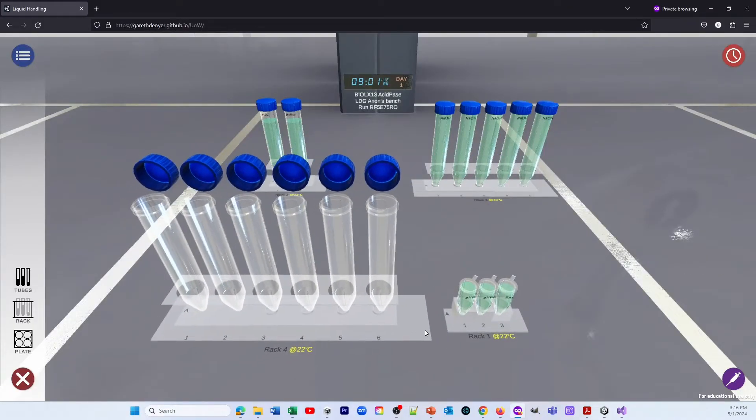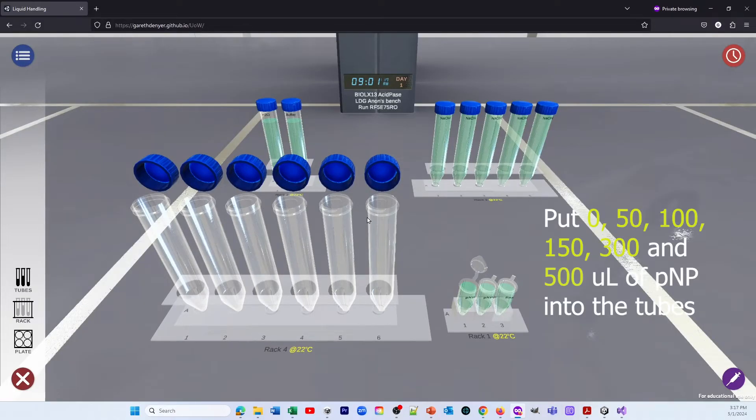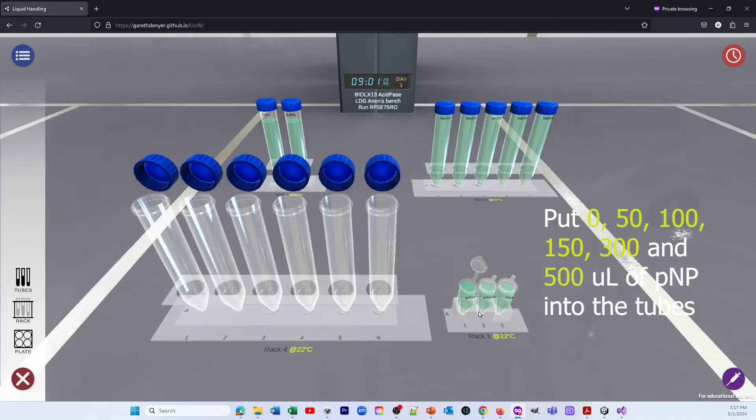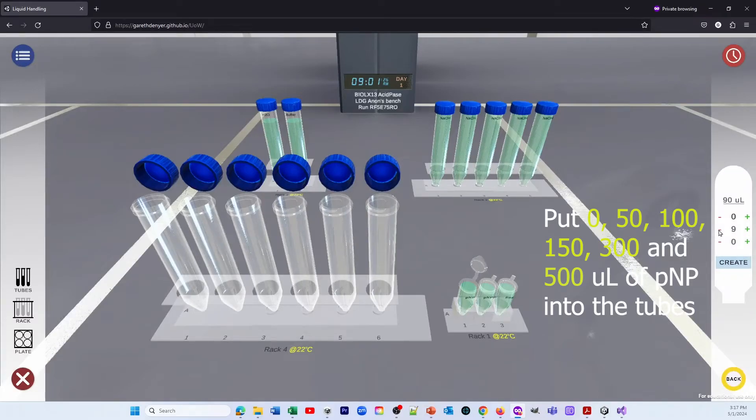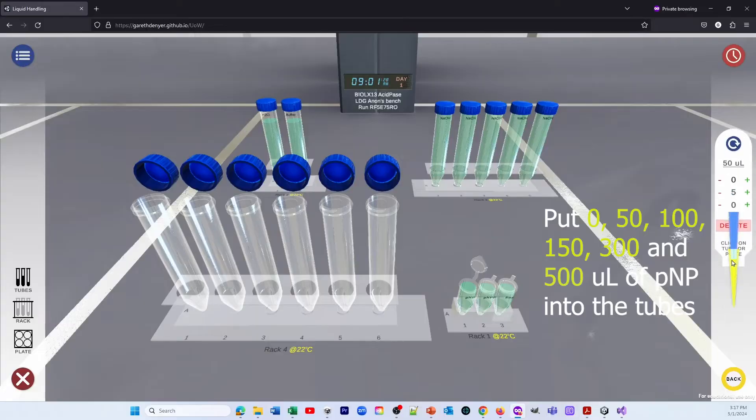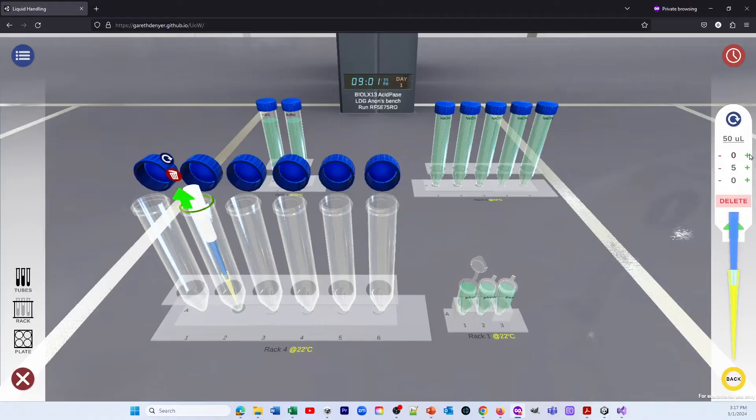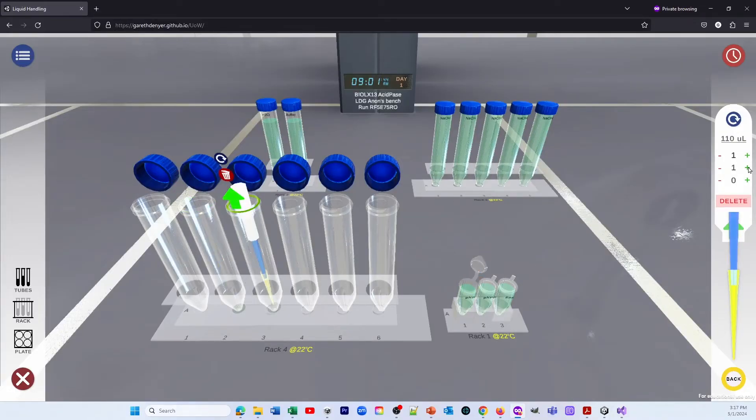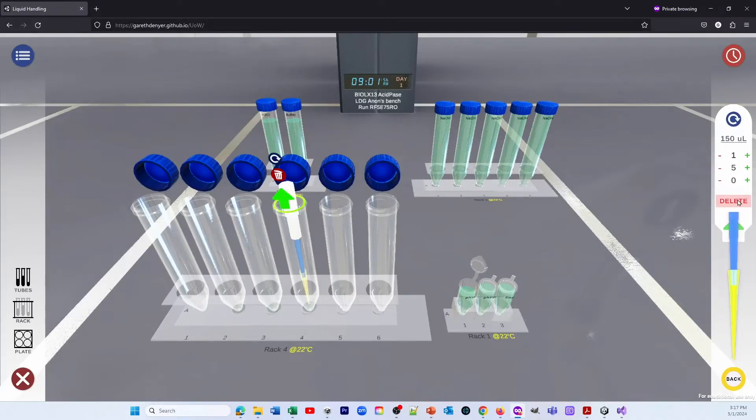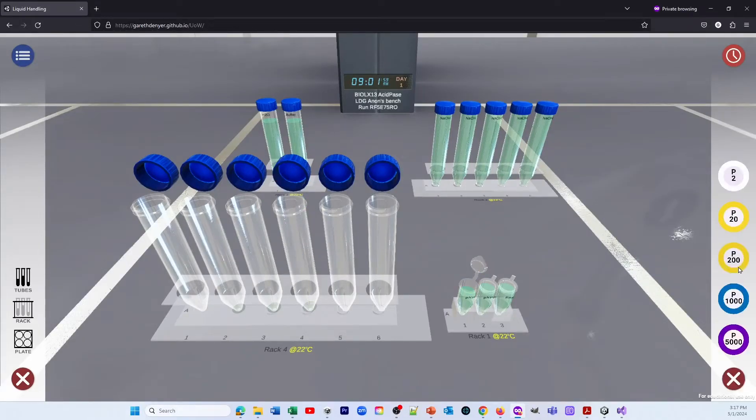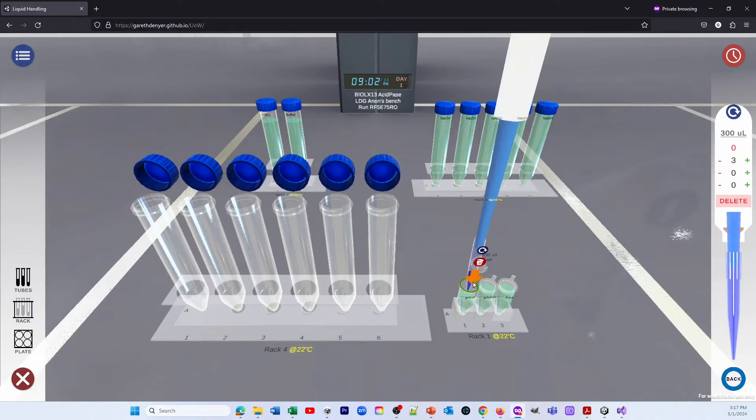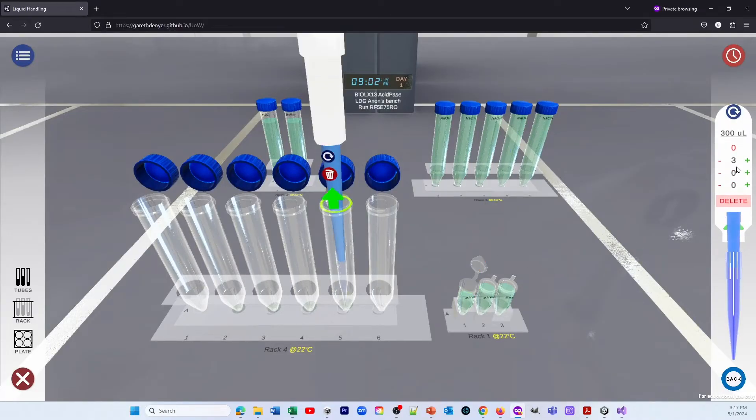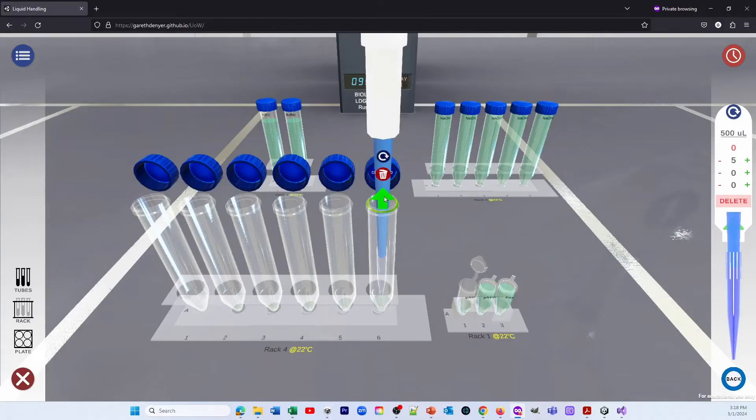And we're now going to create different concentrations of PNP by putting 0 to 500 µL of PNP into each of those 6 tubes. So using the correct pipettes, a P200 for the first couple of additions, and then a P1000 for the others. So in go the volumes. And each time, as I said, we're using a different pipette, so hopefully we'll get the most out of the accuracy of the pipettes by doing that.